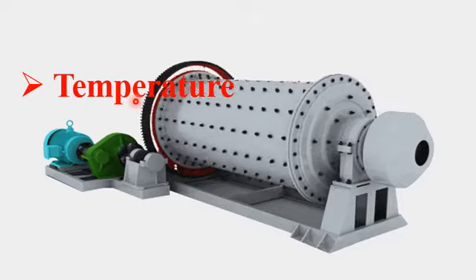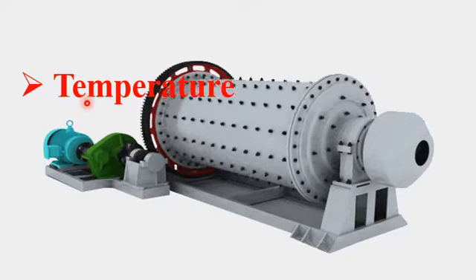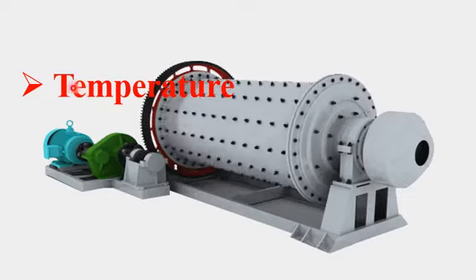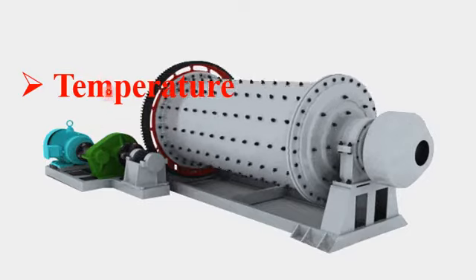So students, keep in mind that the temperature of the ball milling inside the chamber will depend on the frequency with which the balls and the bulk material which you want to crush are moving. So the frequency of the collision of the balls and the precursor or the bulk material is very important in order to consider temperature. And if the temperature inside the ball milling chamber is high, this will result in agglomeration, and this will cause an increase in particle size. So temperature is a very important physical parameter.